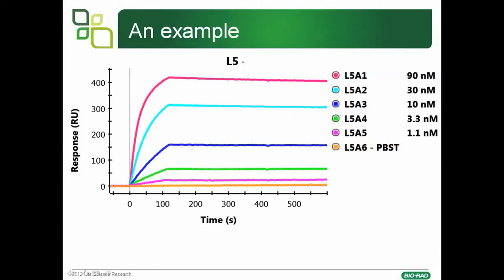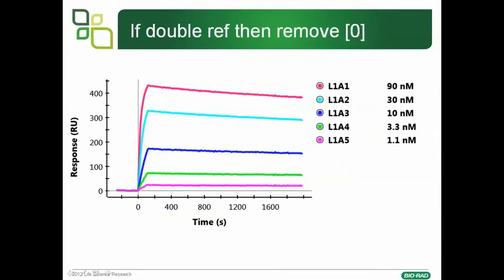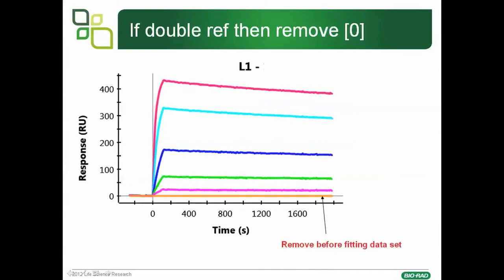We're now going to work through a real example. This is a data set, and the first thing we check for is that there is a dose response — the highest concentration gives the highest response, and as the concentration is reduced, the response is reduced. Before exporting it for fitting, we need to check that we've got a stable baseline and that the data is correctly offset to zero for both the x- and y-axis. We also need to make sure that there is curvature in the sensorgram so that the computer can accurately predict the maximum response. If the data is double-referenced, for example to A6, it's important that the A6 channel is removed before it is fitted.